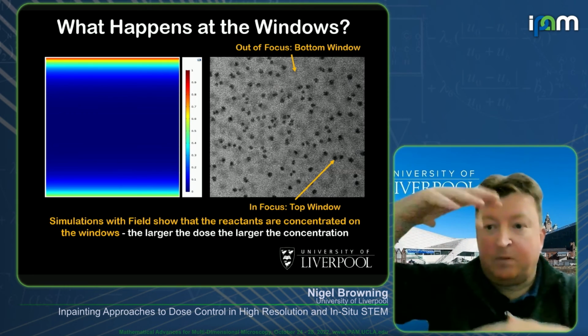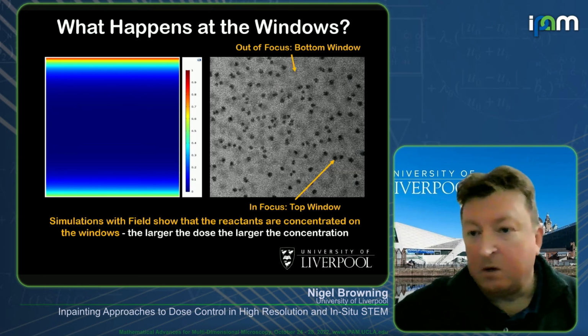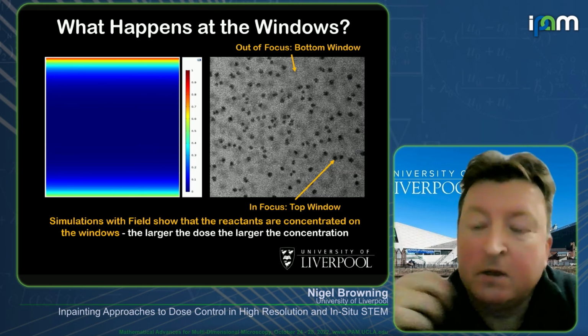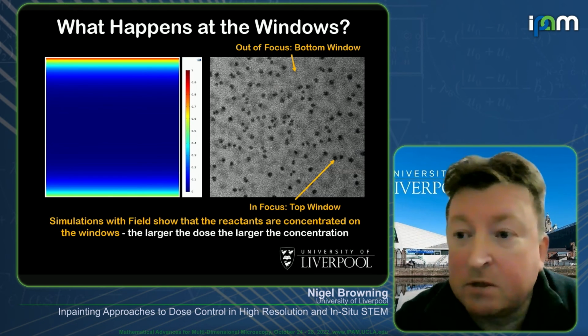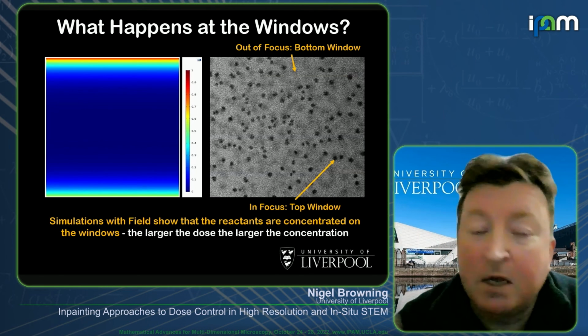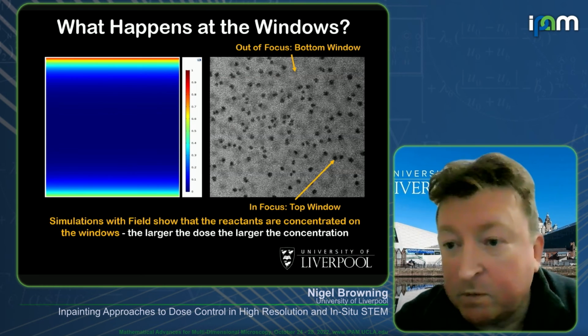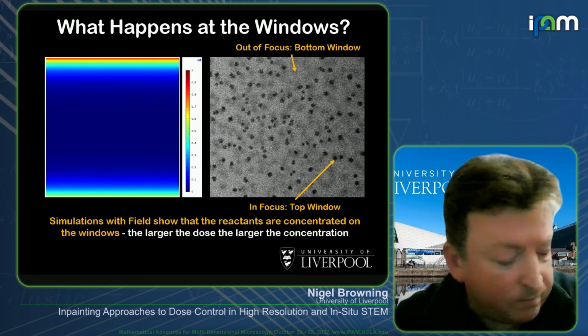If you turn the sampling down, so again, you've got a bigger distribution between when the electrons go in and how much they go in, then you change the overall distribution that's taking place and you change the kinetics of the reaction. And this is exactly what we would expect to have in all of the damage experiments that we see for the high resolution in-situ going forward.